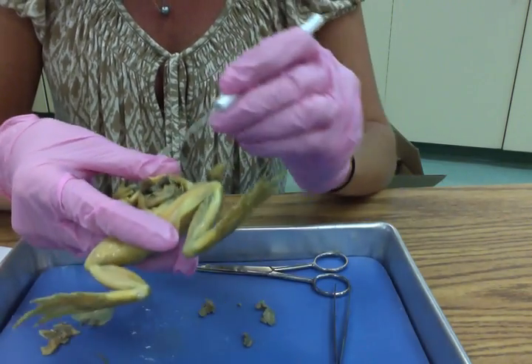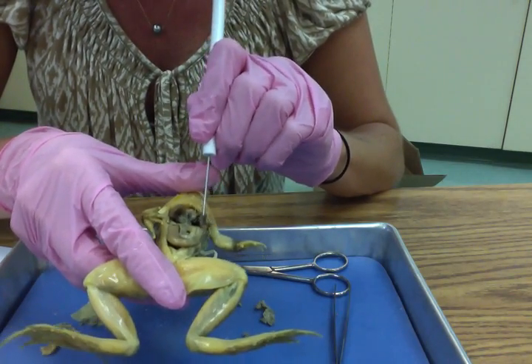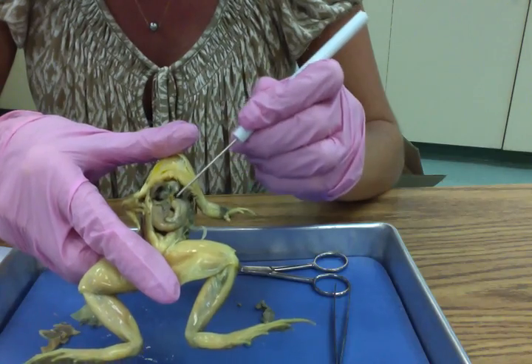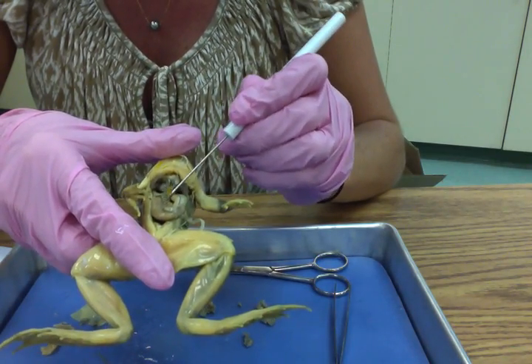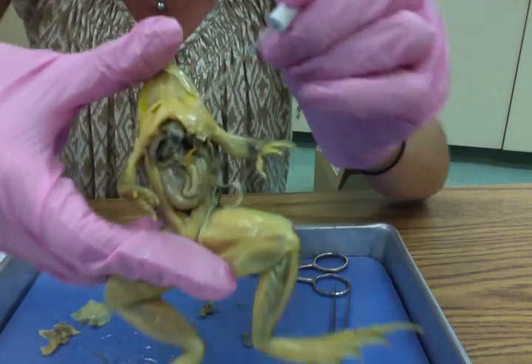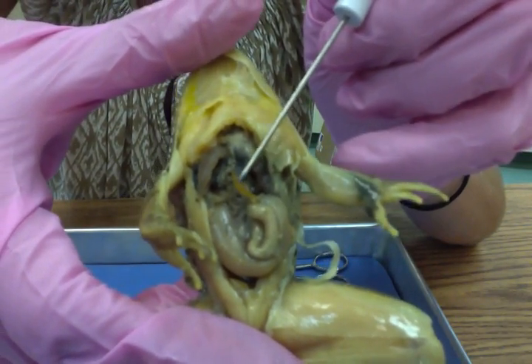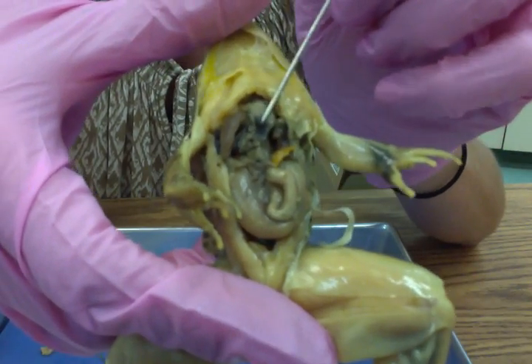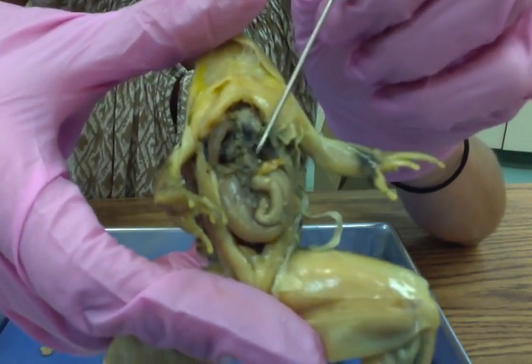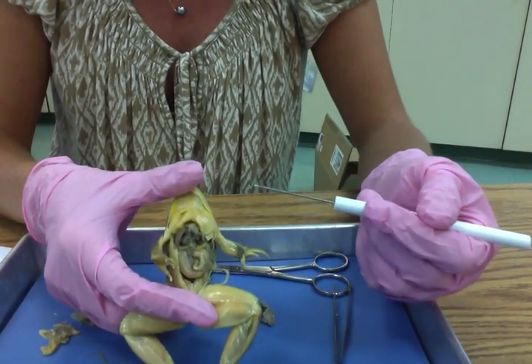Okay, kind of in between the lungs, off to one side, you're going to see a little kind of bright orangey yellow spaghetti-like structure. It's real hard to see. So this guy right here. It kind of looks like a piece of spaghetti squash maybe. That's part of the fat bodies on the frog.